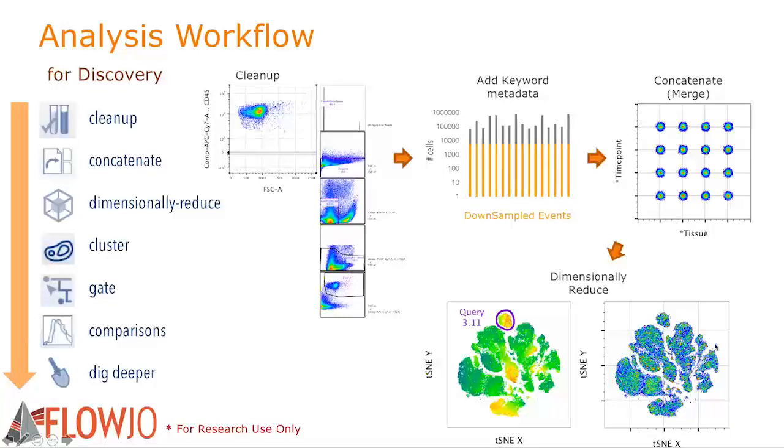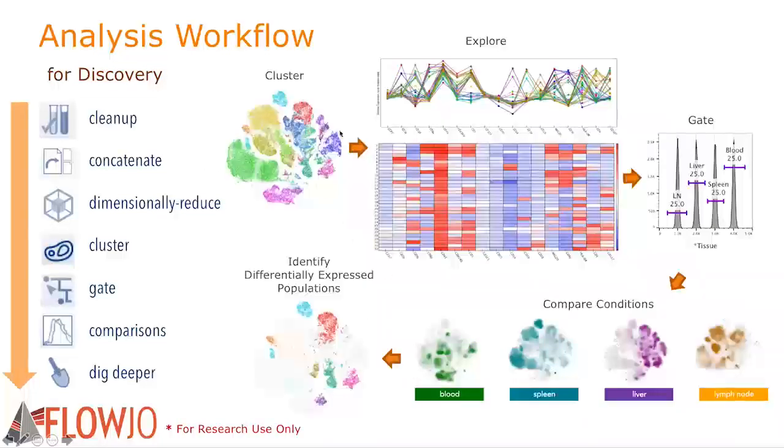If you do a dimensionality reduction on each individual sample, you'd get a completely different continent structure, a completely different map out of that. And it's no longer going to be comparable across samples. If you take all the data, merge it together, and do one dimensionality reduction approach at the same time, then you get a common data space. You can cluster on that data all together and get a common set of clusters. And then we can view the clusters, determine the phenotypes, and still go back and pull apart the concatenated file.